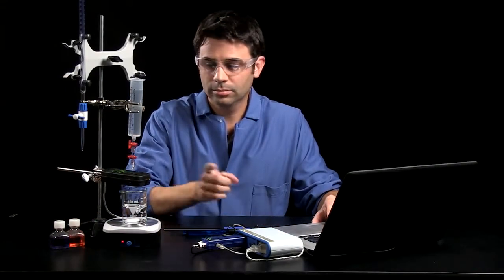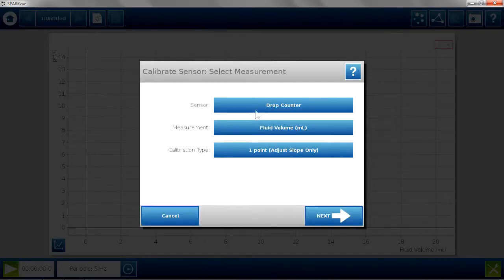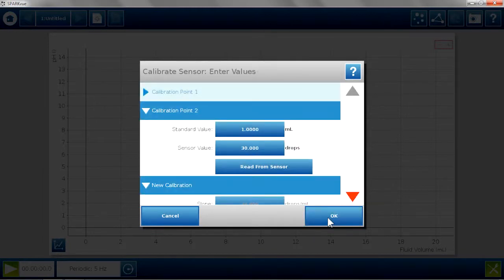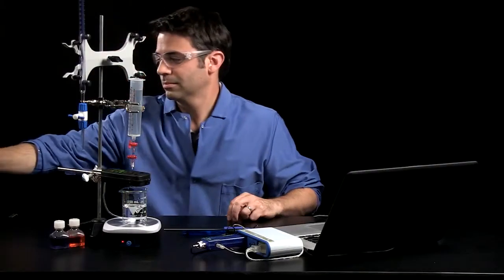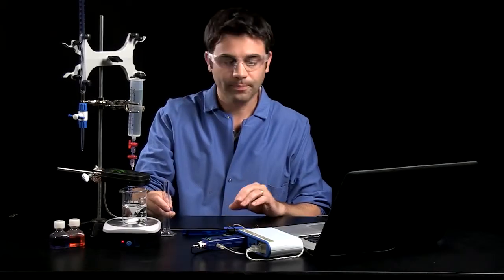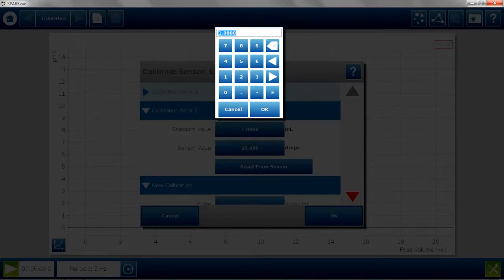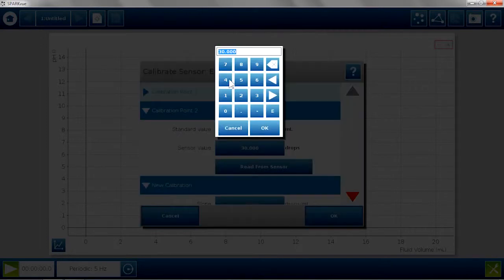And I need to calibrate my drop counter so that it knows what the fluid volume is. So I'm going to calibrate my drop counter, fluid volume. And the way to do this is you use a graduated cylinder. You drop the titrant through the drop counter into the graduated cylinder until a certain volume that you want. I know that when I did this, there were, in 10 milliliters of volume, the drop counter counted 327 drops. So I'm going to use that as my calibration.